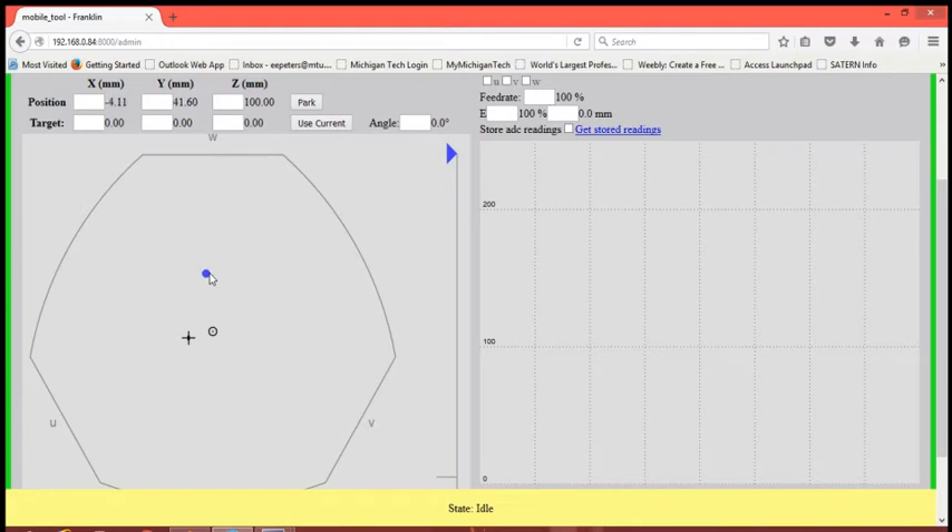You can also use the microscope by entering values in the white boxes to the right of the user interface. By entering a plus sign followed by a value, you will add that value to the current position of the scope in the direction of the axis of the box that the cursor is in. By entering a plus sign followed by the subtraction symbol before entering a numerical value, the scope will instead subtract that value.